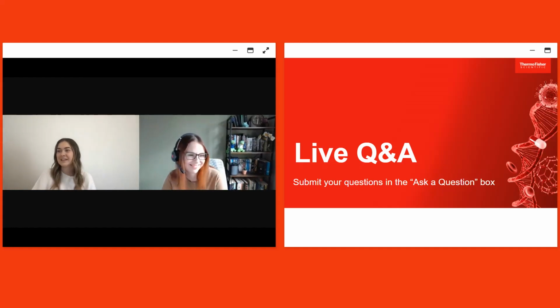Great, thank you, Zoe. Now, how do I know if my instruments are supported? Yes, so again, one of the documents we provide during any kickoff meetings is the list of supported instruments document. This shows all the instrumentation that is supported on the Chromeleon version you choose, as well as a full list of minimum firmware requirements to ensure the best connection to the software. Again, this is something that your account manager can share.